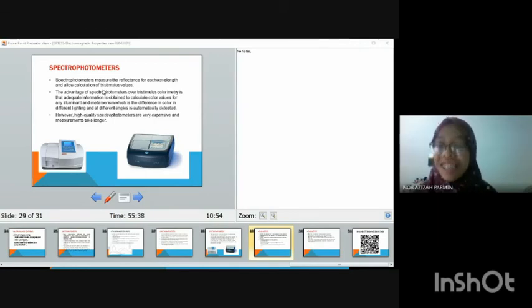but definitely measurement takes longest because kalau buat scan rate pun daripada 400 hingga 700, dia ambil masa dalam berapa minit untuk siapkan scan rate tu, untuk calculation tu dapat kamu punya peak tu.